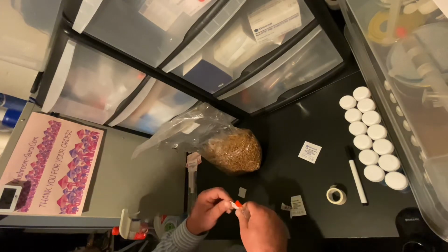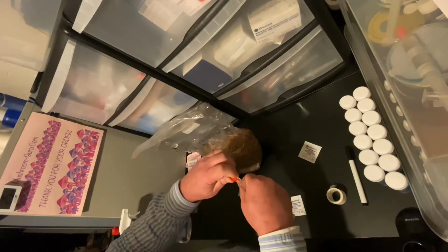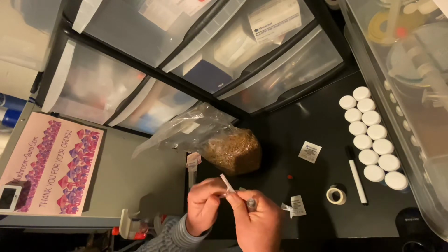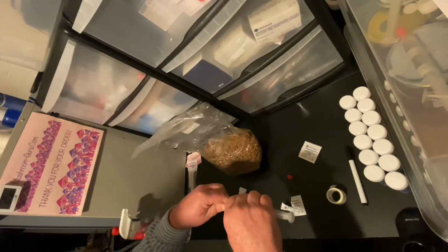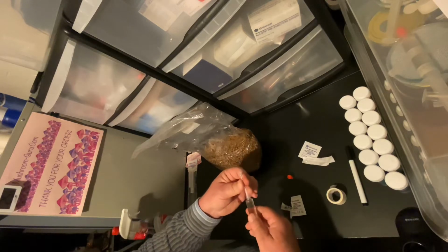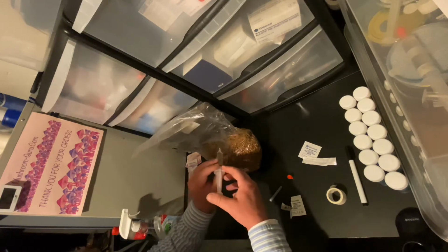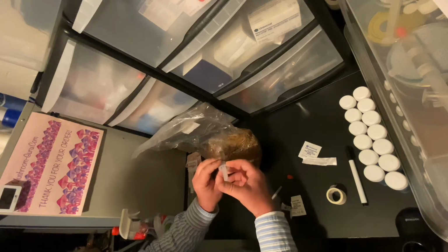This has now been cleaned. The needle is sterile when it comes, so we remove the top. This here is actually a very nice wine cap that I'm going to try out for the first time. Okay, and then just remove, put it in the middle there, and just squirt it around some places.